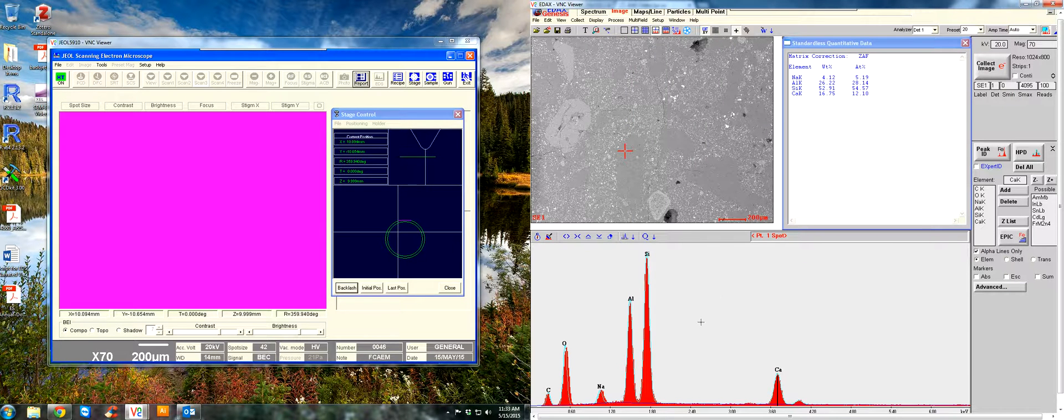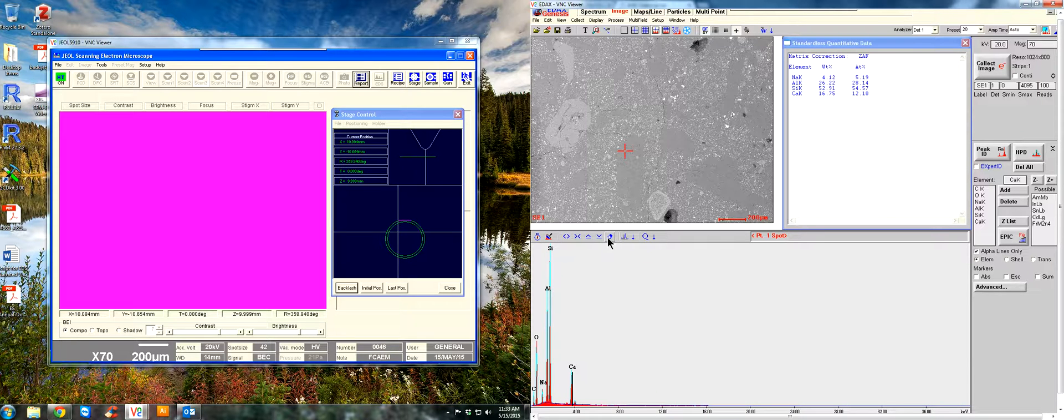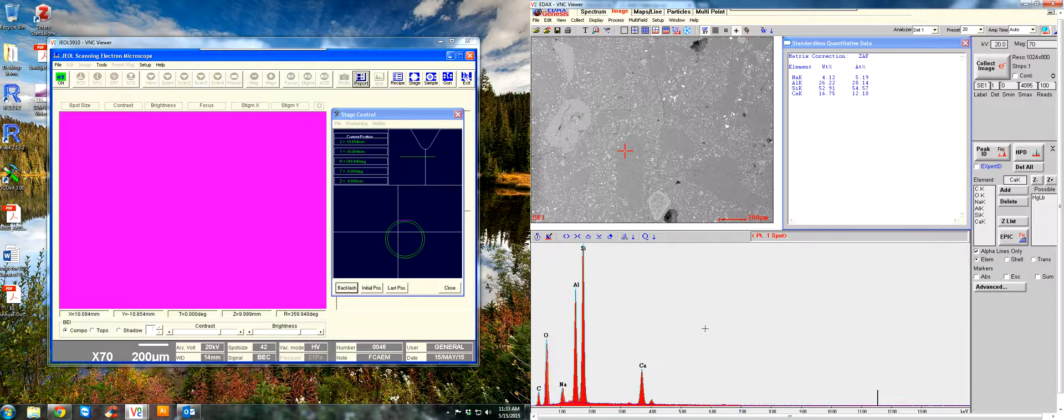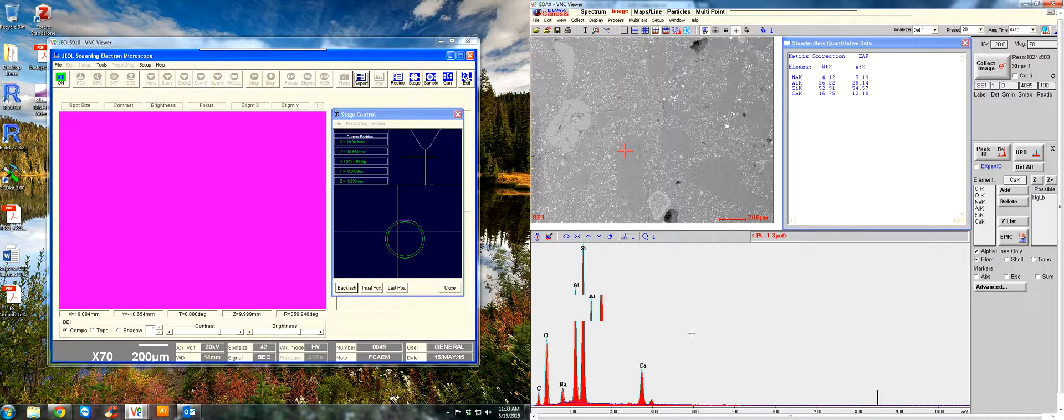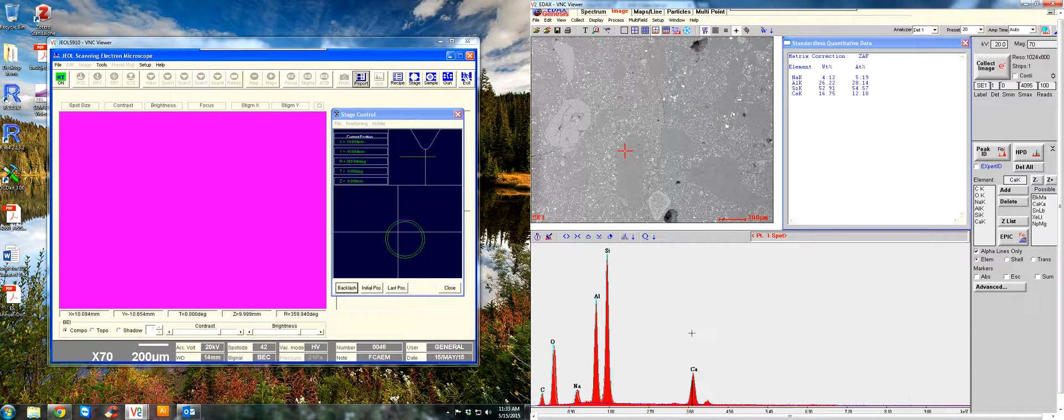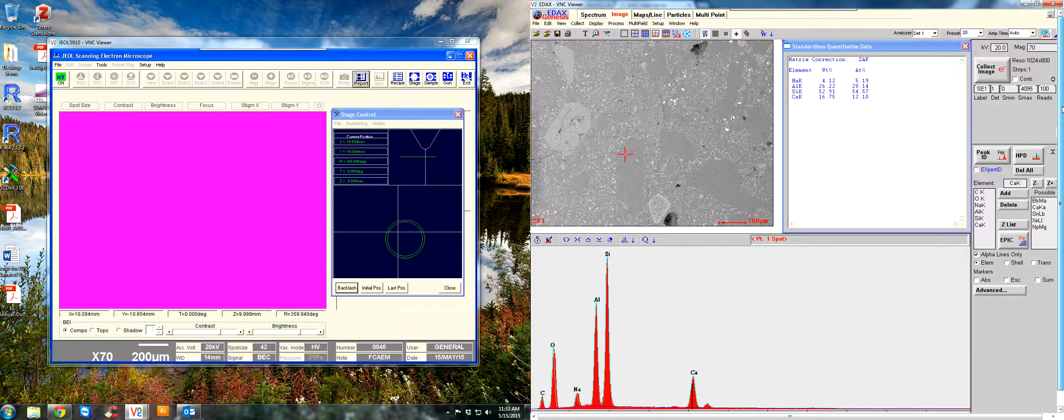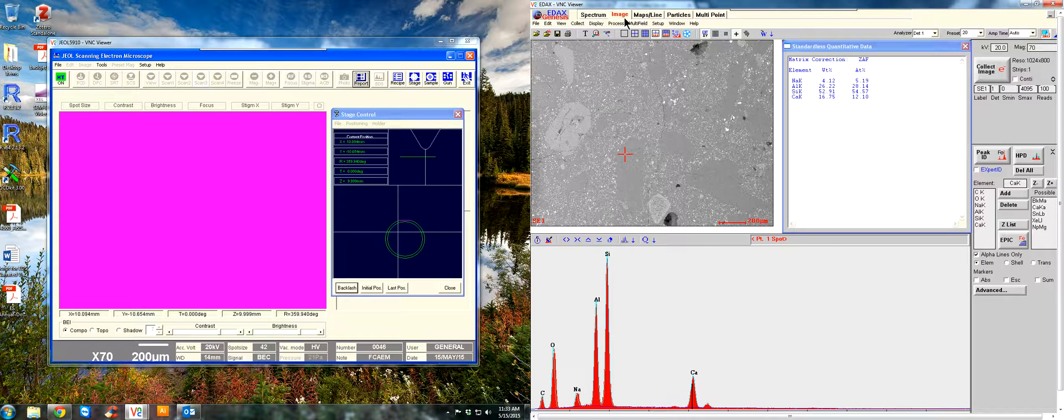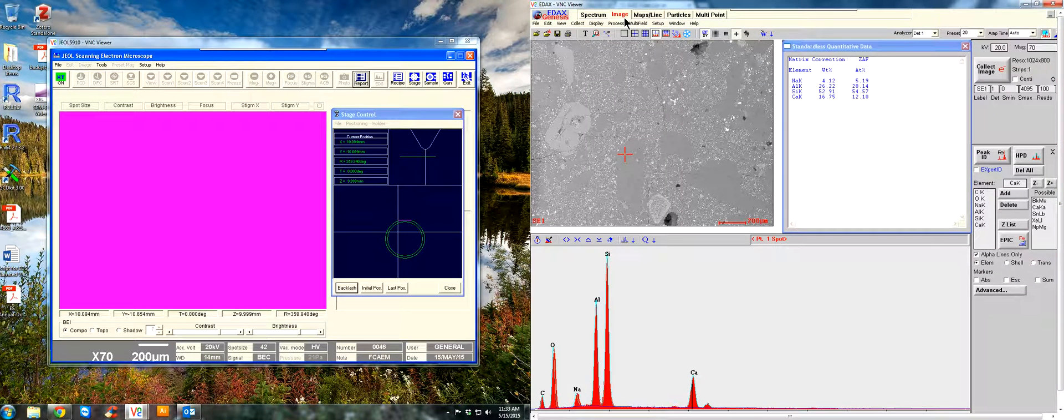And here on the plot, I just want to mention, if you ever want to go back to the original scale, just press this Home button. And it brings you back to the original scale. And then you can just manually move this over again. And that's beginner's quantitative analysis in the image tab. Thank you.